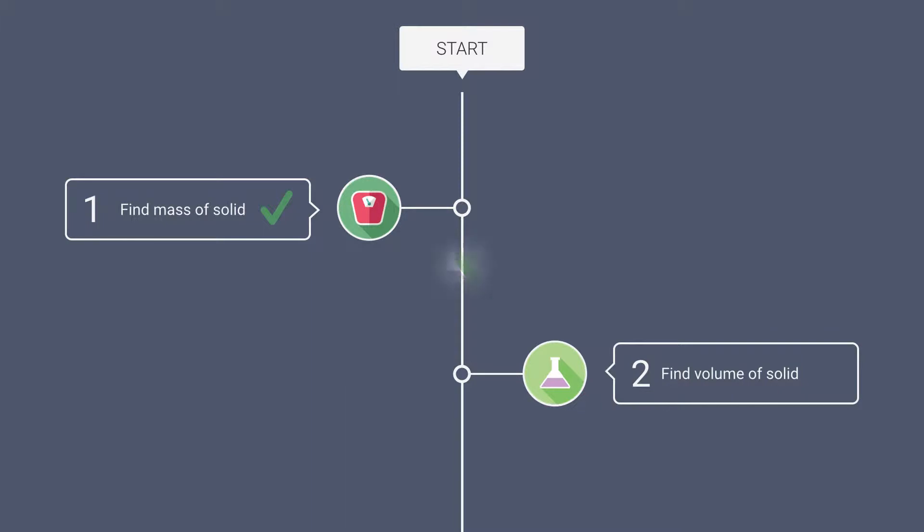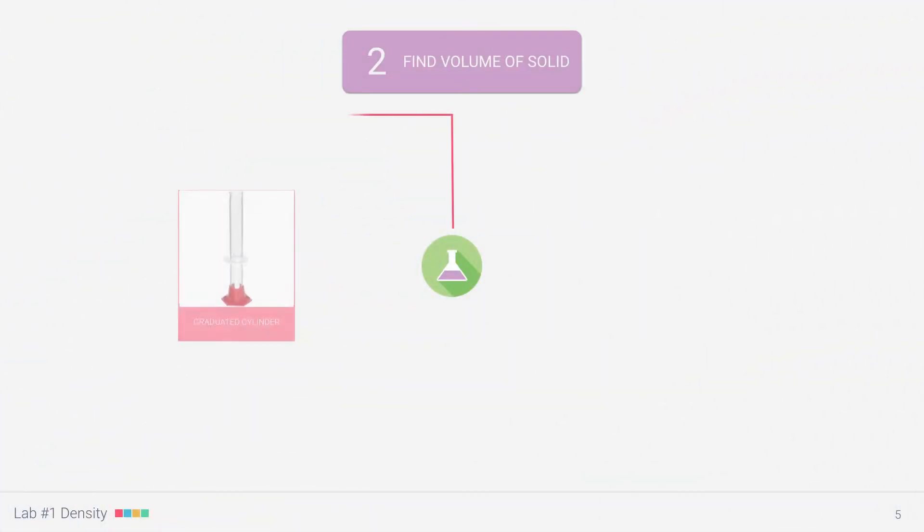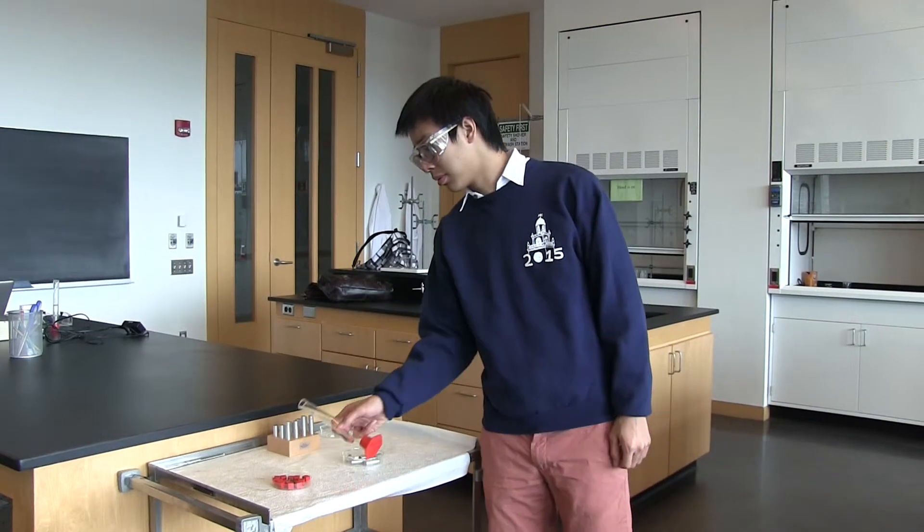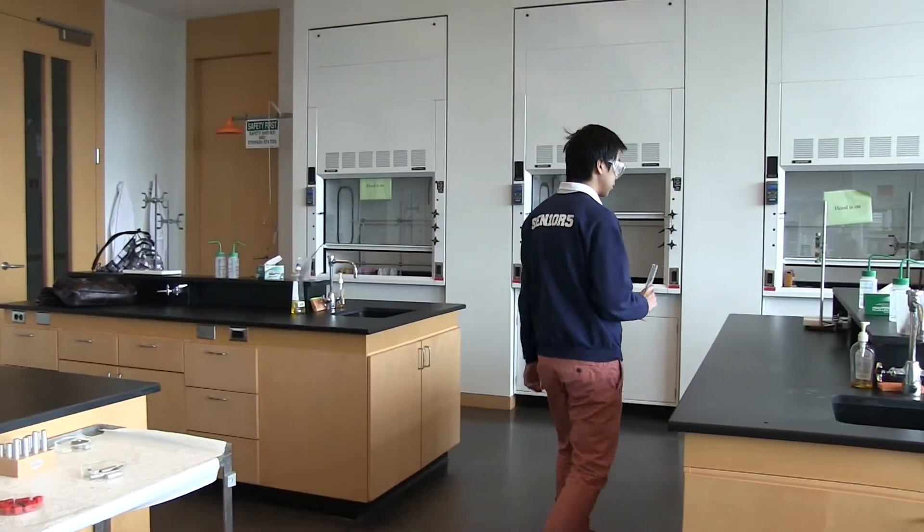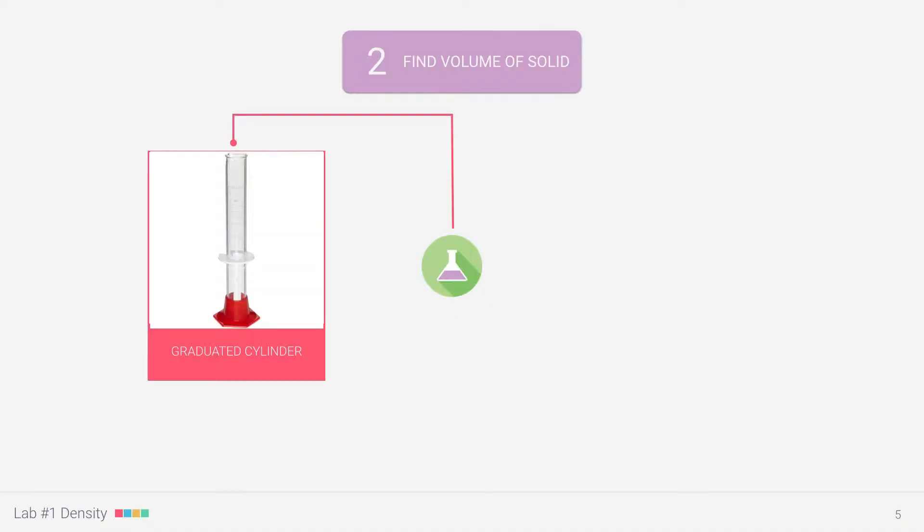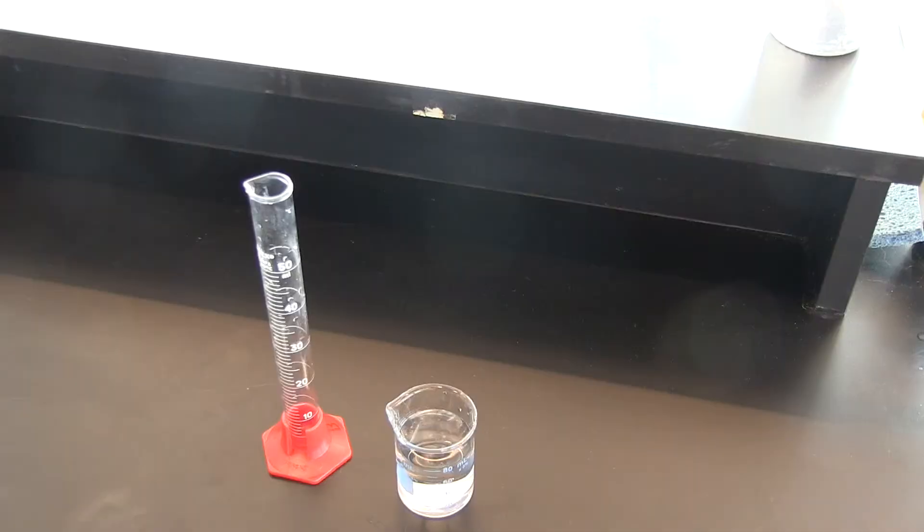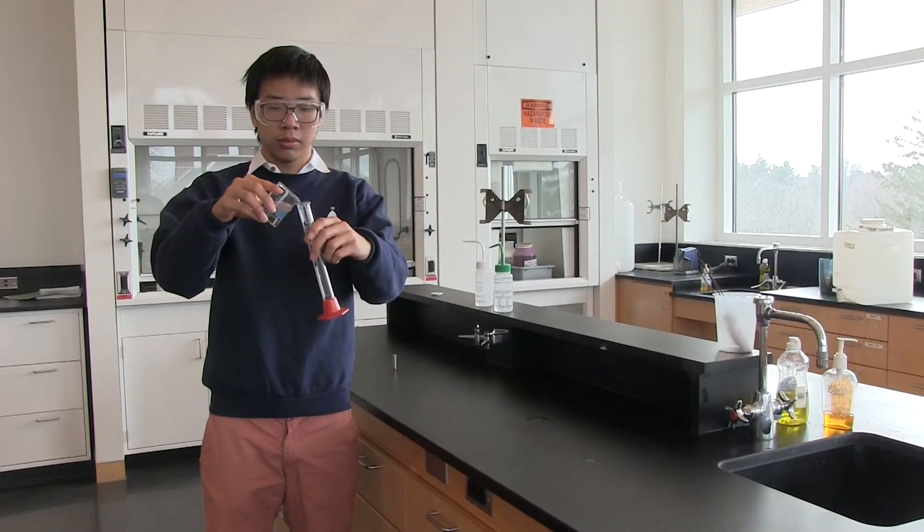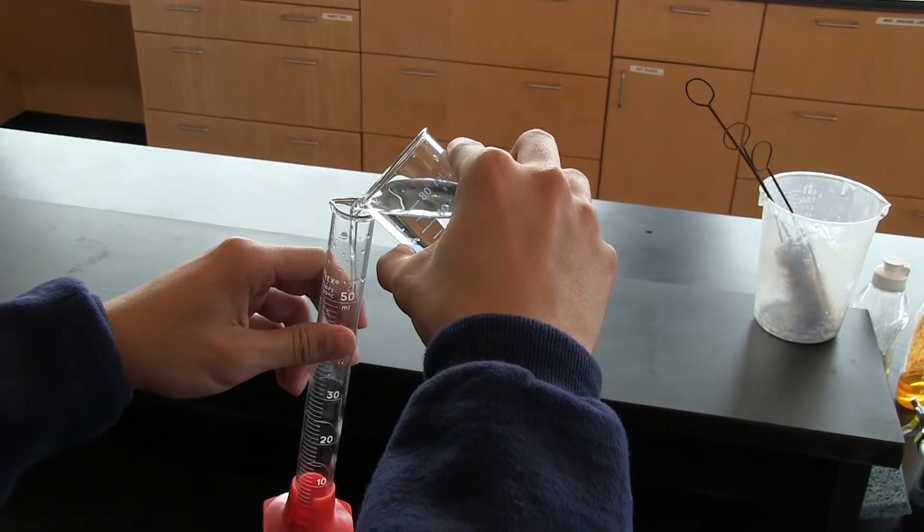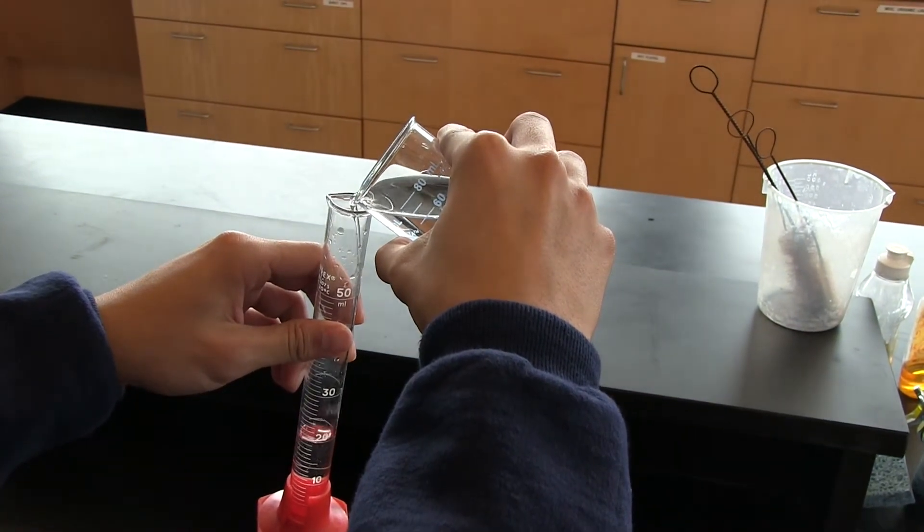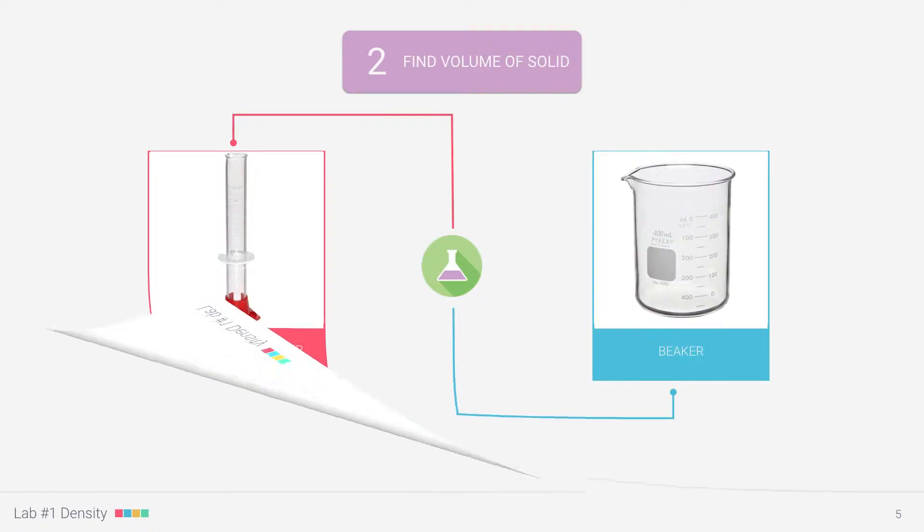Step two, find the volume. To find the volume, we're going to use a graduated cylinder. Grab one of the larger cylinders from the cart and head over to the bench. We'll also need to use a beaker, which you can find in one of the drawers. Fill your beaker up with tap water and then pour the water from the beaker into the cylinder, filling the cylinder about halfway. But before we go any further, let's figure out our game plan and take a look at what we're doing.